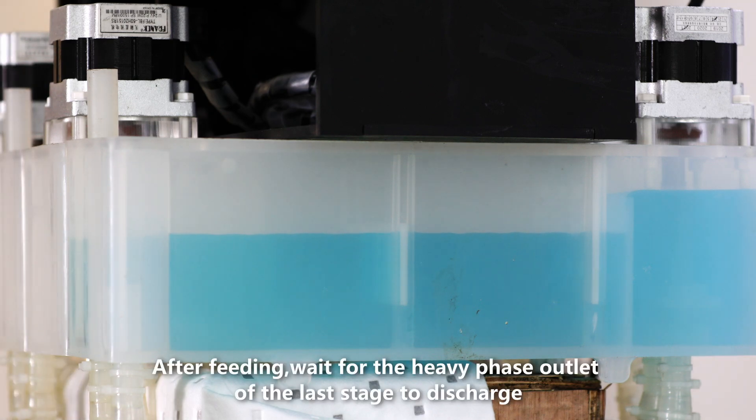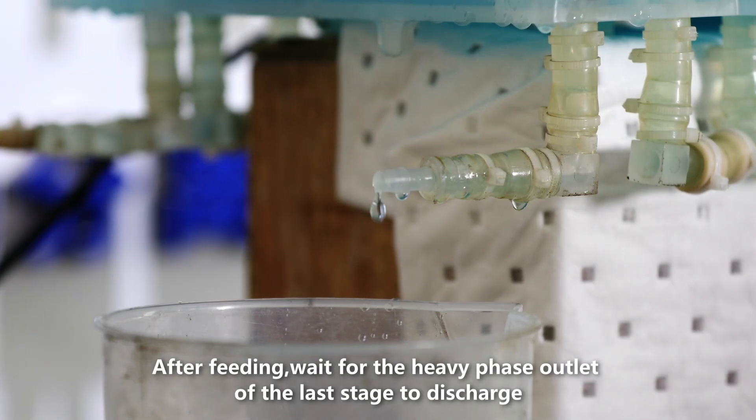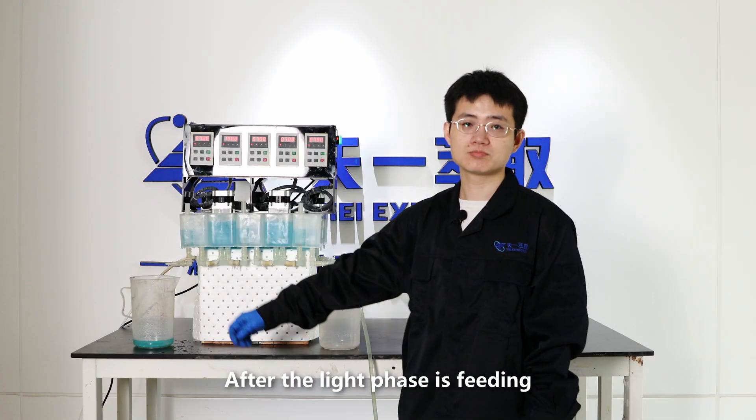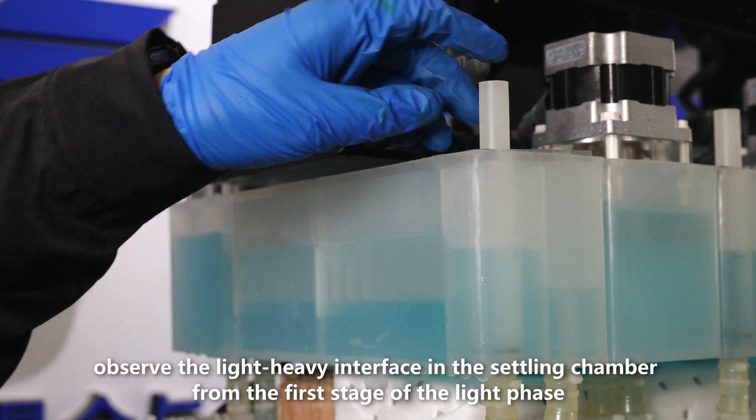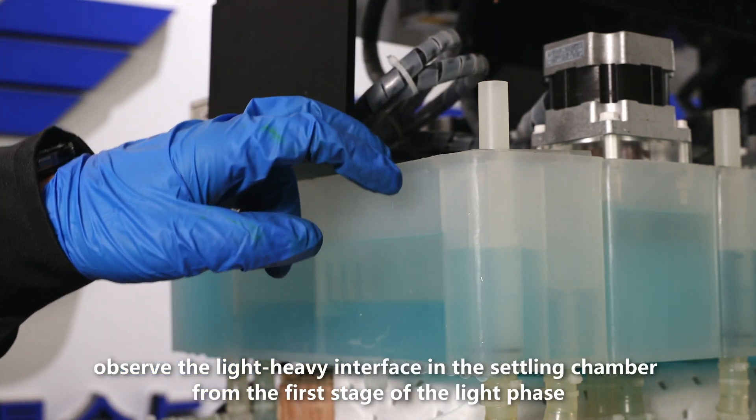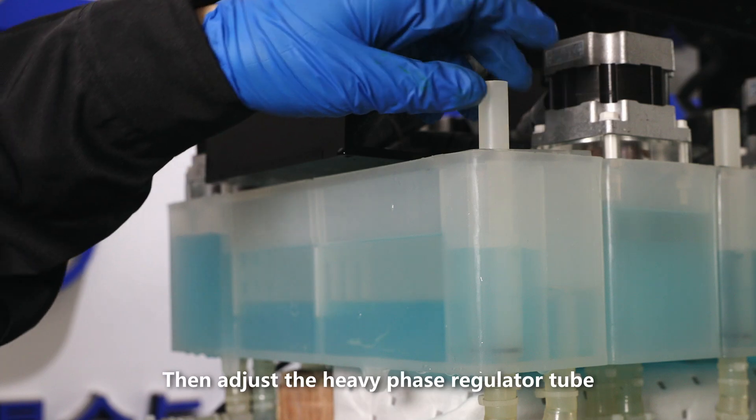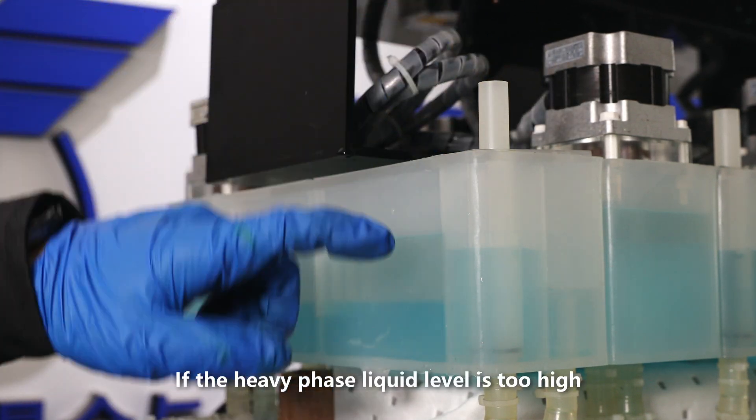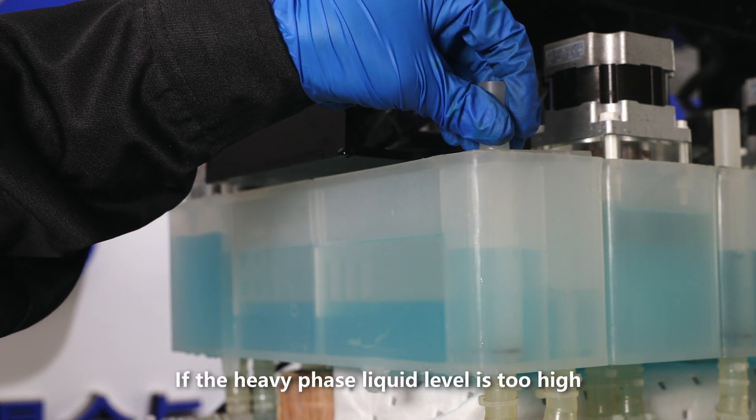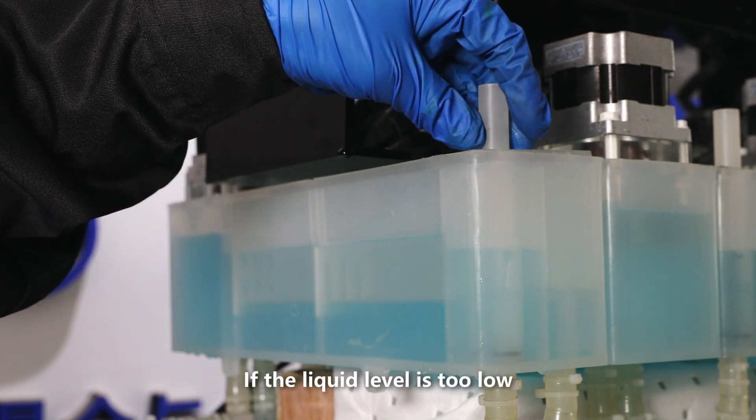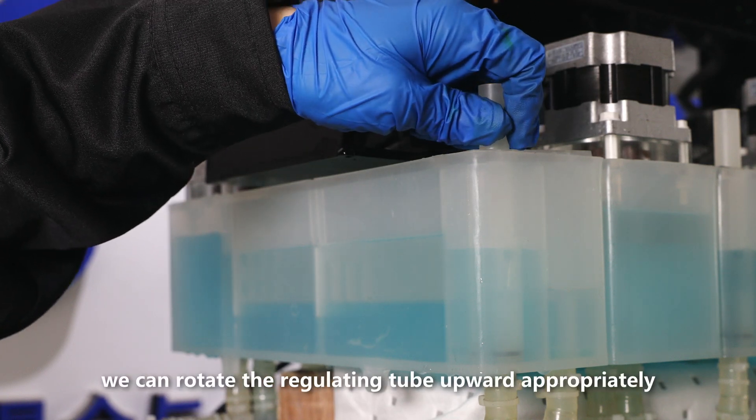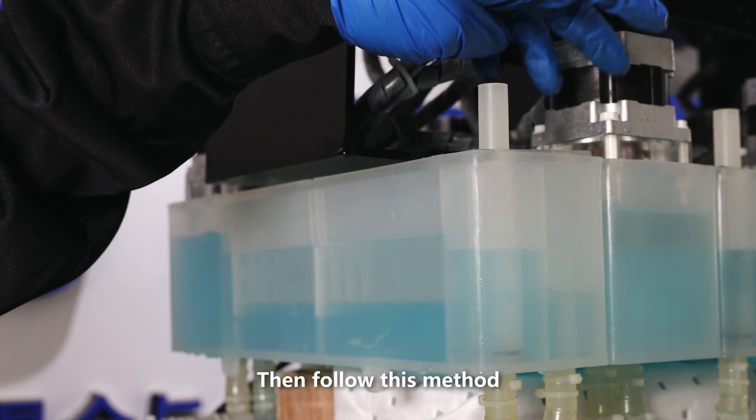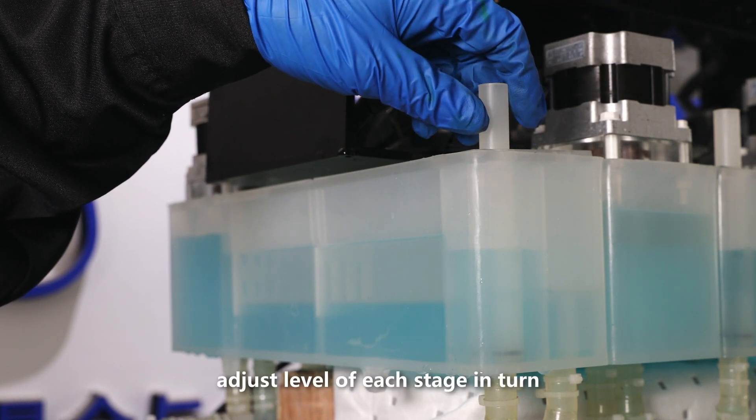After feeding, wait for the heavy phase outlet of the last stage to discharge. The light phase begins to enter. After the light phase is feeding, observe the light-heavy interface in the settling chamber from the first stage of the light phase. Then adjust the heavy phase regulator tube, and try to keep the ratio at 1 to 1. If the heavy phase liquid level is too high, we can rotate the regulating tube downward appropriately. If the liquid level is too low, we can rotate the regulating tube upward appropriately. Be careful not to use too much force. Then follow this method. Adjust level of each stage in turn.